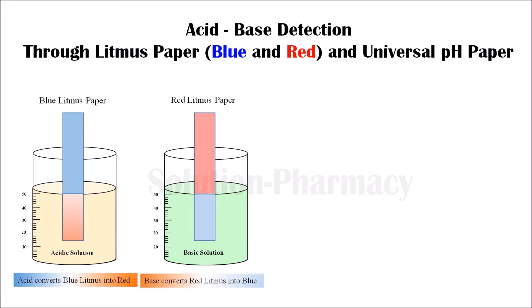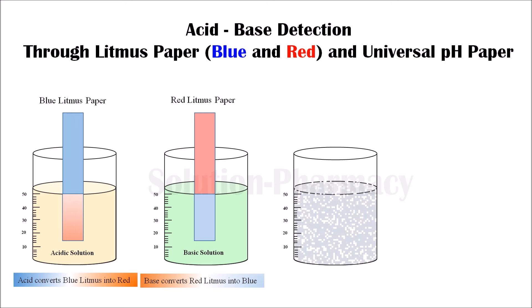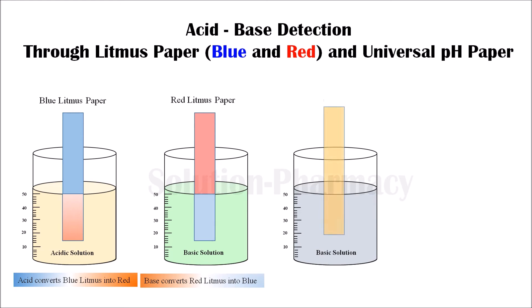So let's see how it works. Take a beaker with a solution that is basic in nature — we know it is basic because it converts red litmus to blue. Now dip the universal pH paper into this solution, then observe the change in the color of the universal pH paper.